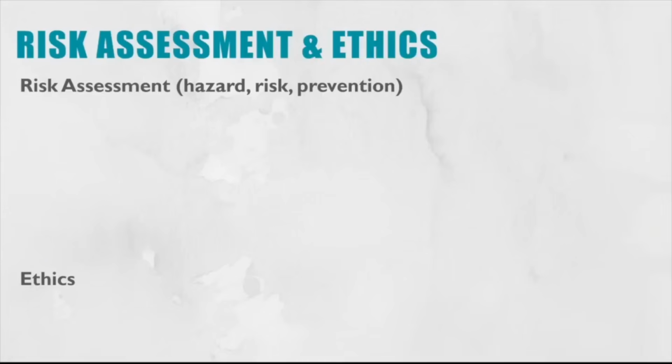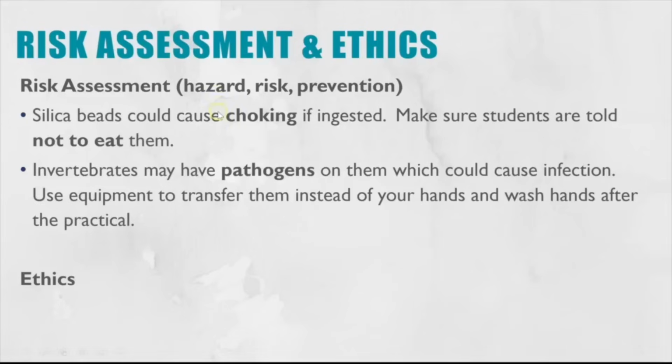So the other things you need to consider are the risk assessment and ethics. So the risk assessment, the silica beads themselves are inert, so they shouldn't cause any harm. However, because they are small spheres, there is a risk of choking if you were to try and ingest them. So sounds obvious, but students should be told, do not eat the beads. Invertebrates, they could have pathogens on them, which could cause infection if you were touching them. So that's why we use the teaspoon to transfer them instead of your hands, but you should still also wash your hands after the practical.